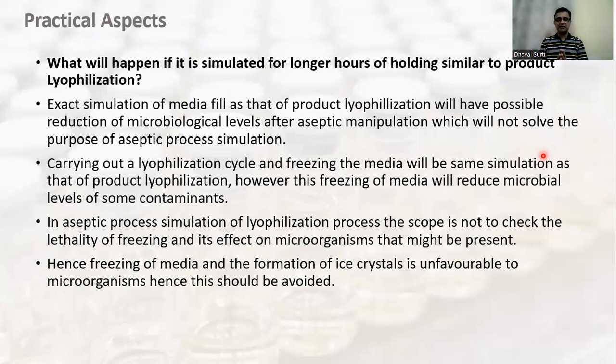Hence, freezing of media and the formation of ice crystals is unfavorable to the microorganism, hence this should be avoided. On the contrary, freezing will not favor the growth of microorganisms, so we have to avoid it.